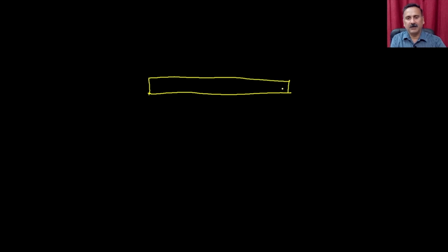Now, how are you going to perform surface plasmon resonance spectroscopy? What you require is a very simple system, right? You require a glass, a metal sheet, okay, and on which you require the glass. Okay, so this is going to be a glass.